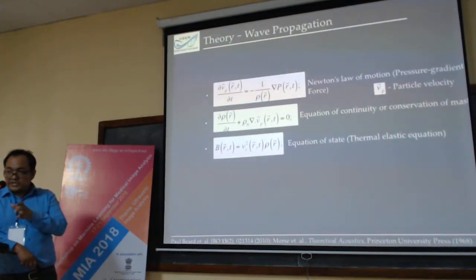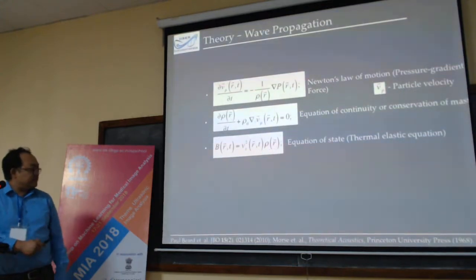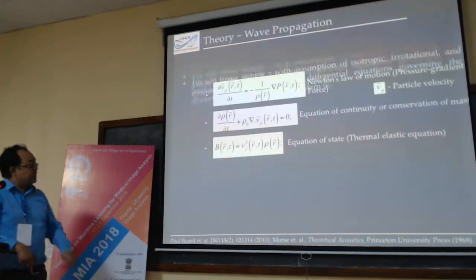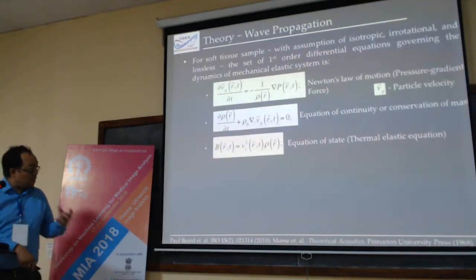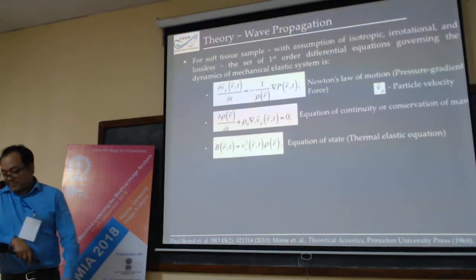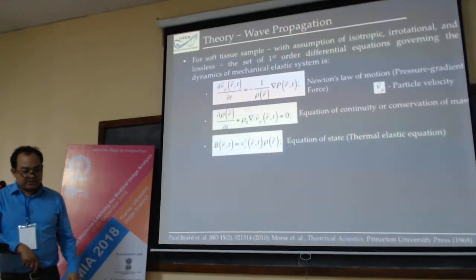This initial pressure rise will give the thermoelastic expansion. This expansion has to be propagated through the medium, which is controlled by the thermoelastic equation. So, I mean to say the whole of the three first order differential equations will govern the generation of the sound wave as well as the propagation of the wave. In terms of the first order differential equations, these are the three equations.